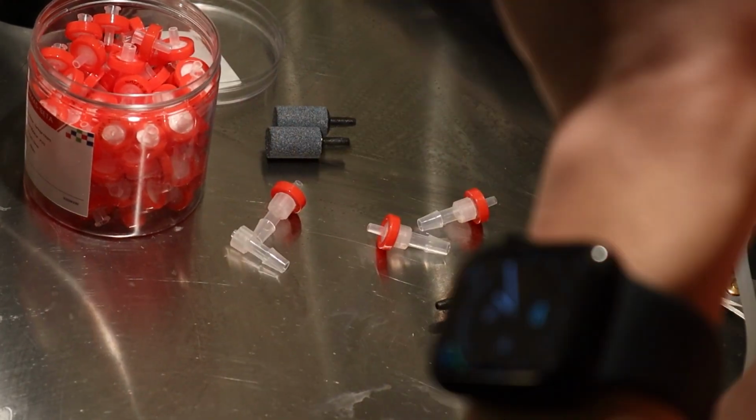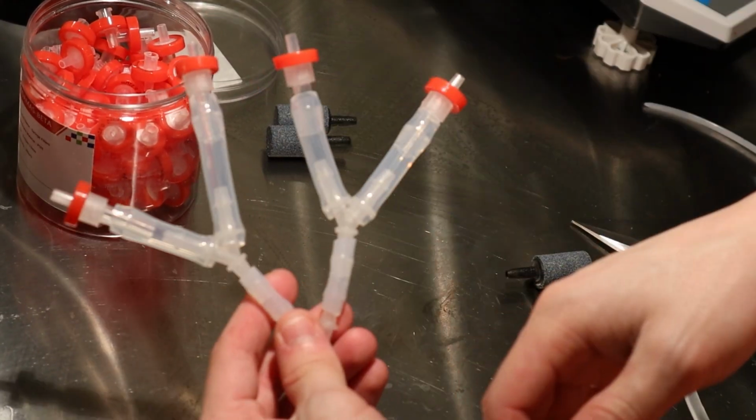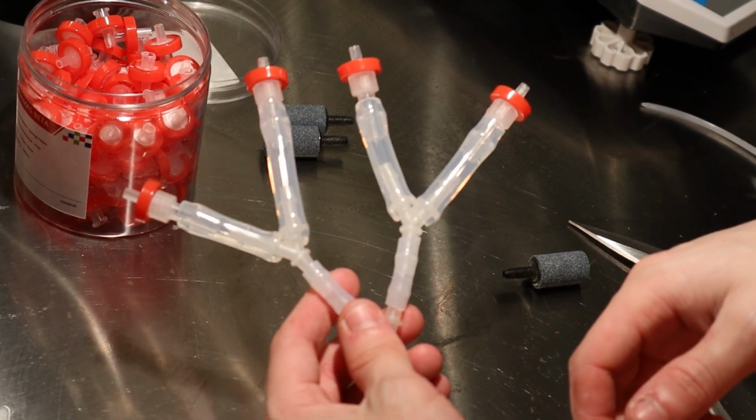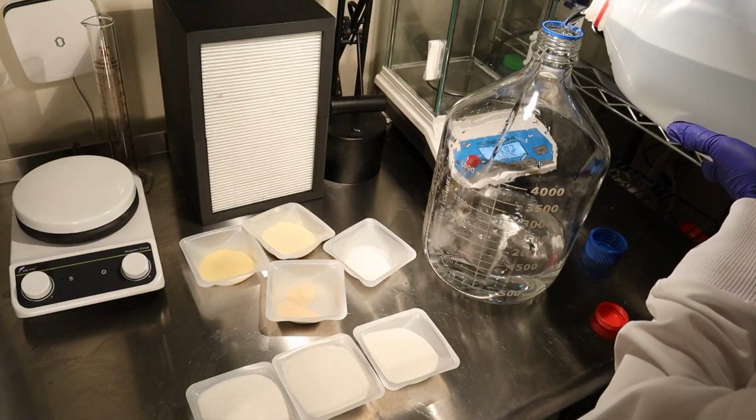To begin culturing again, I started by preparing a splitter for the air pump for my 4 flasks I was going to put in the smaller incubator, and made sure the 0.22 micron PTFE syringe filters fit on it. I then got a large 5-liter media bottle to mix up the media.